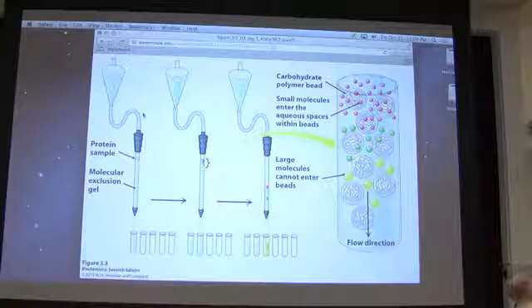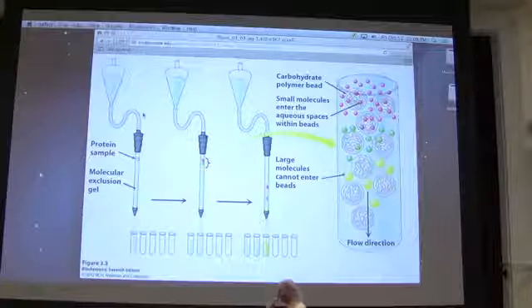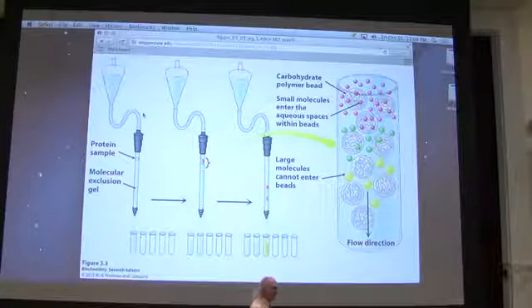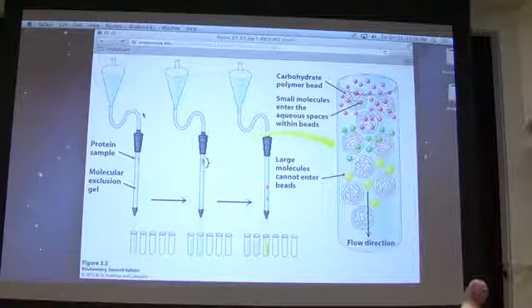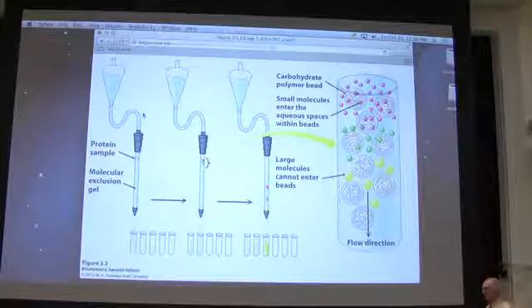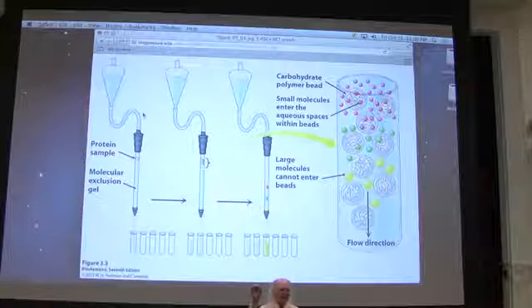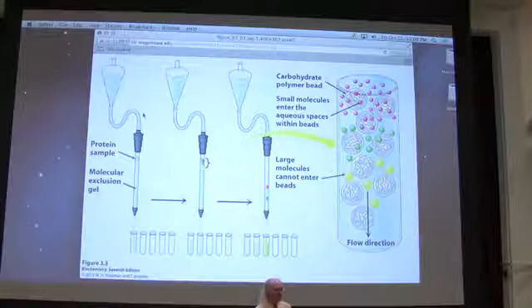Now, this technique relies on something very important. And the important thing that it relies on is the fact that the holes and the tunnels all have a fixed size. They all have a fixed size. That fixed size is called the exclusion limit. Exclusion limit. Why do I tell you that, and why is that important? Okay. Well, if they all have the same size, the exclusion is that they're only going to allow molecules of a certain size to fit into them and travel through them.